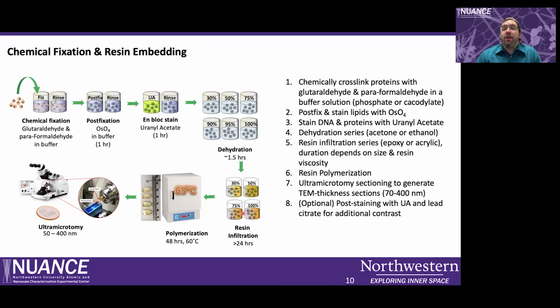do a resin infiltration. This dehydration and resin infiltration step is going to be slightly different if you are starting with your sample in aqueous phase versus organic phase versus dried. If you're starting with your sample in organic phase, you can really skip this dehydration step and just go straight to resin infiltration. The other bit of nuance is that for dehydration and resin infiltration, you want to do as long of washes as possible to really remove all of the water or fully infiltrate the resin.